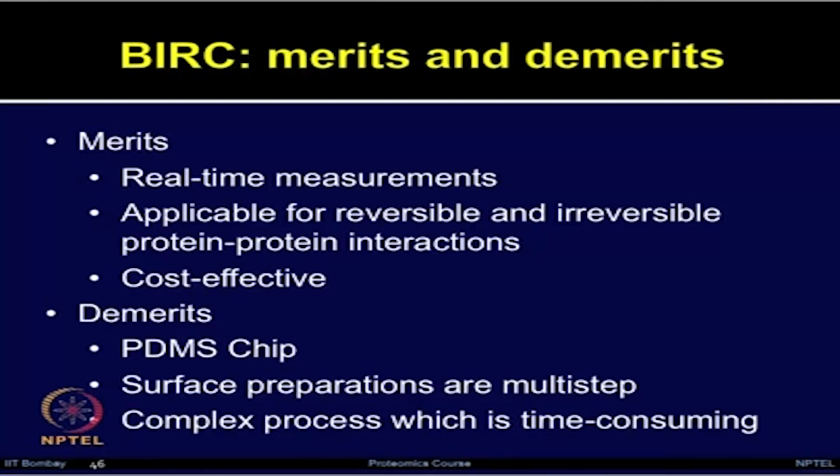Similar to other label free techniques we have discussed today, BIRC also provides real time measurement. It is applicable for reversible and irreversible protein-protein interactions. This technique is very cost effective. However, there are some demerits, such as the use of the PDMS chip. The surface preparation involves multiple steps, and this is a complex, time consuming process.